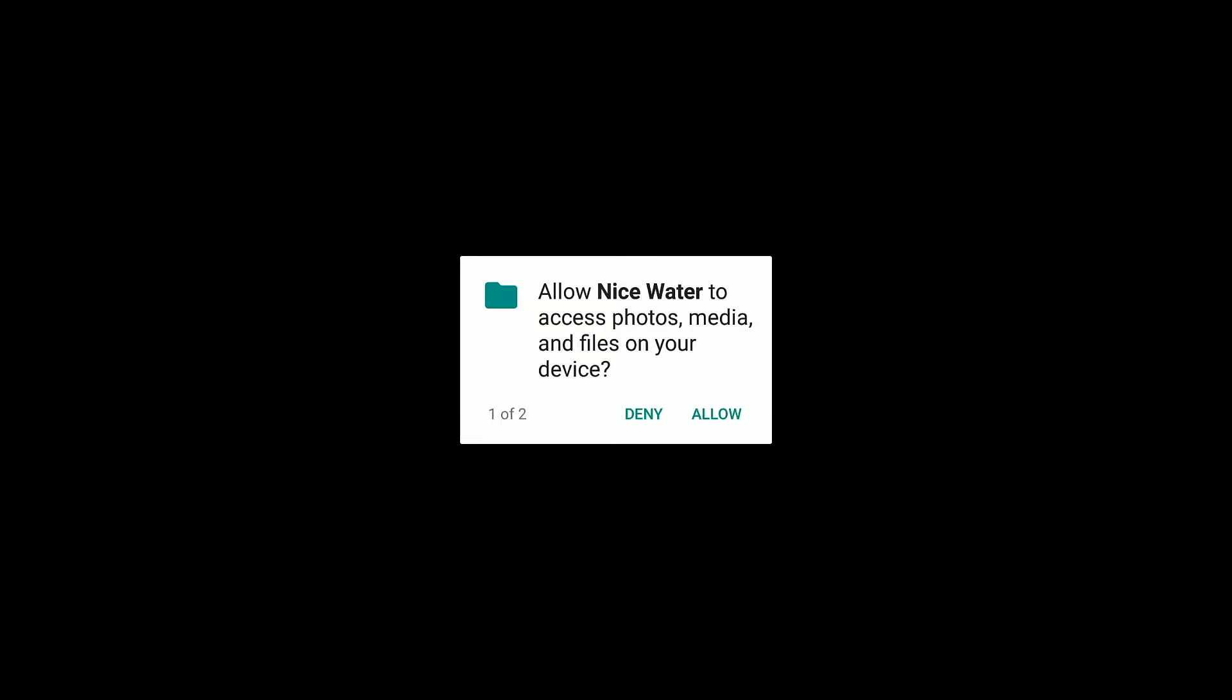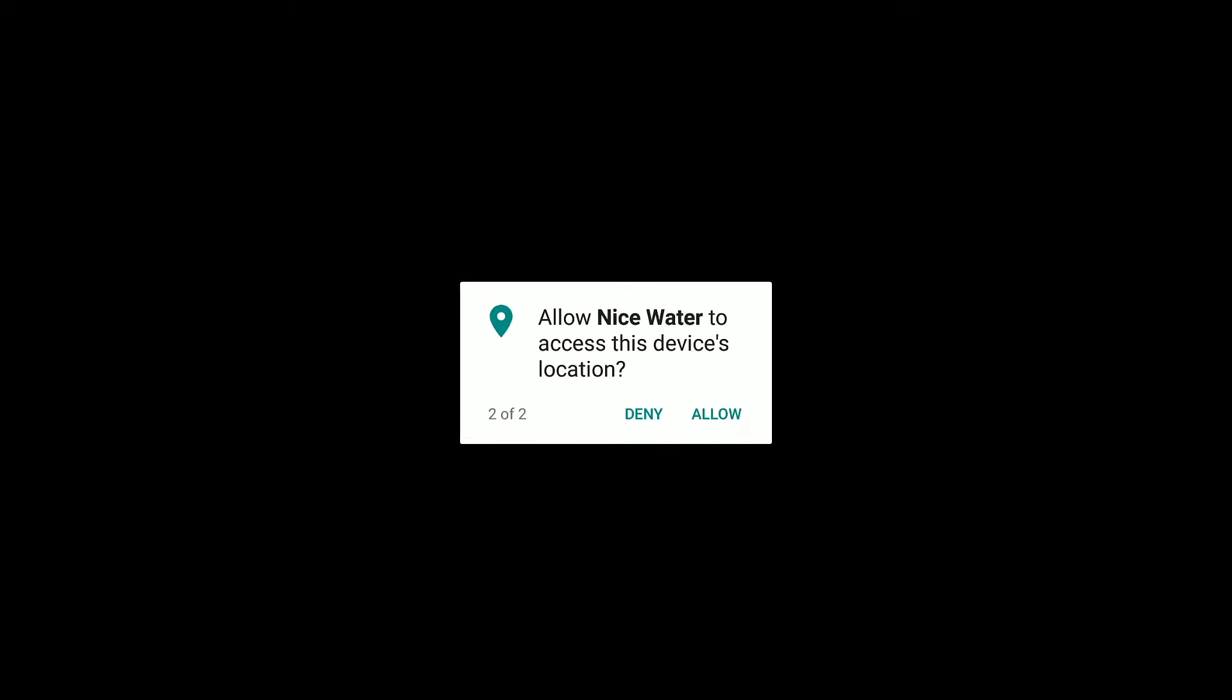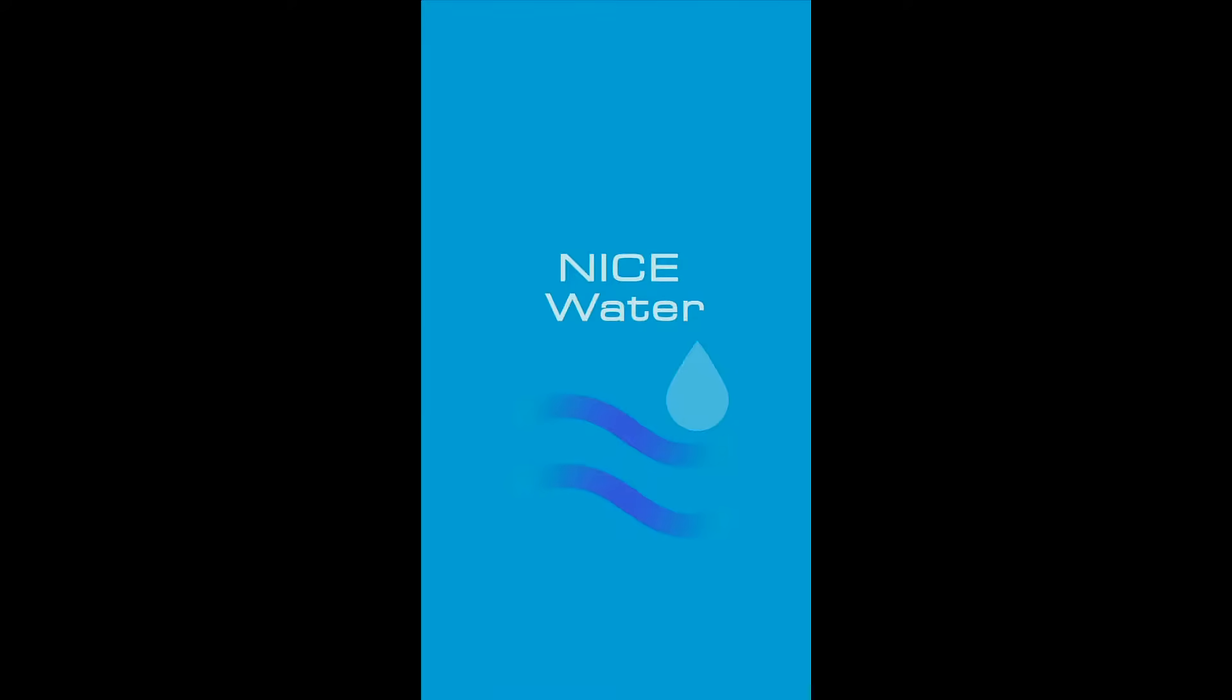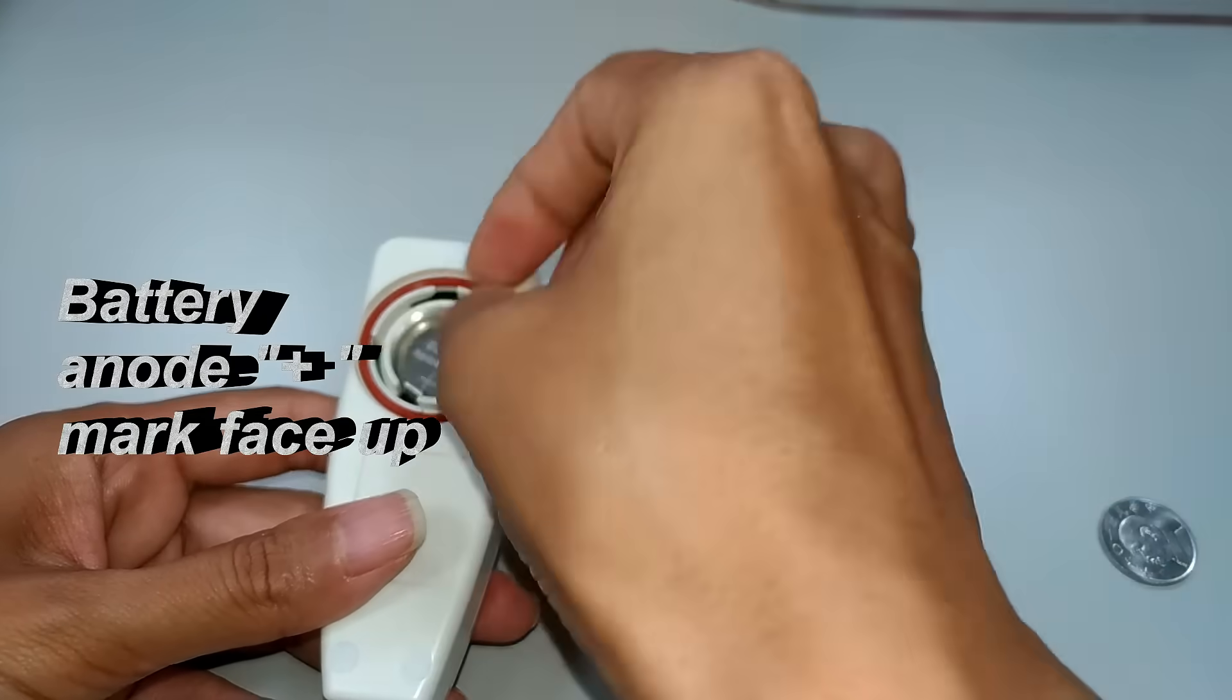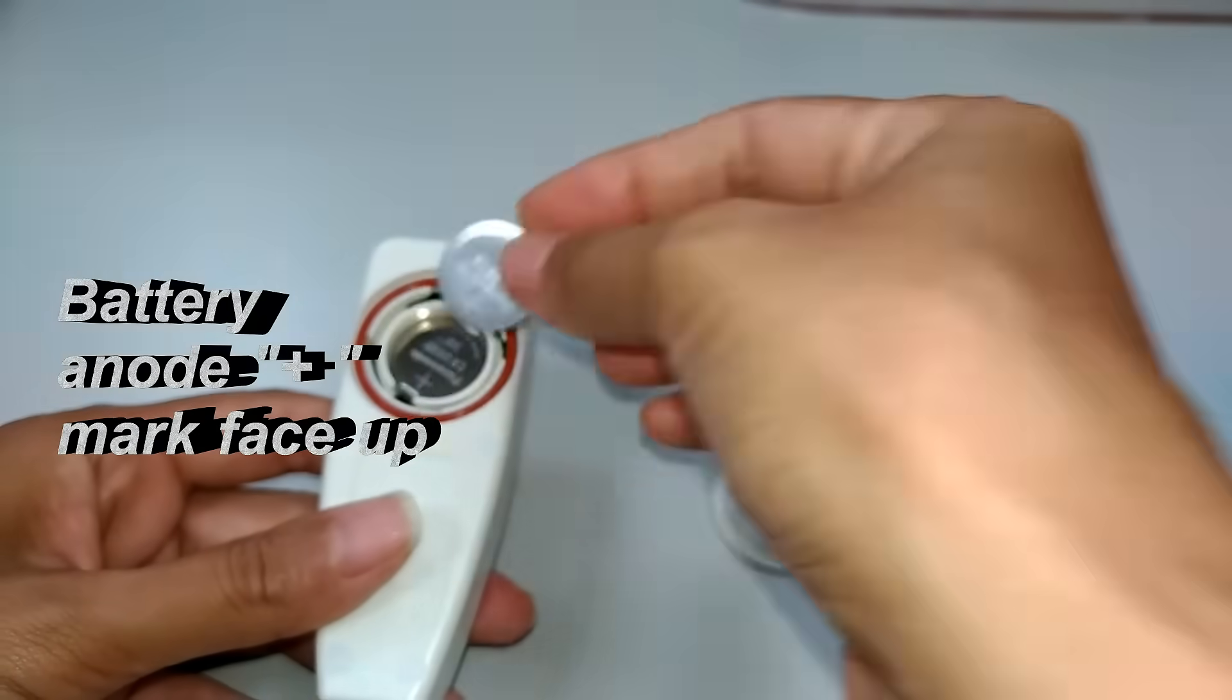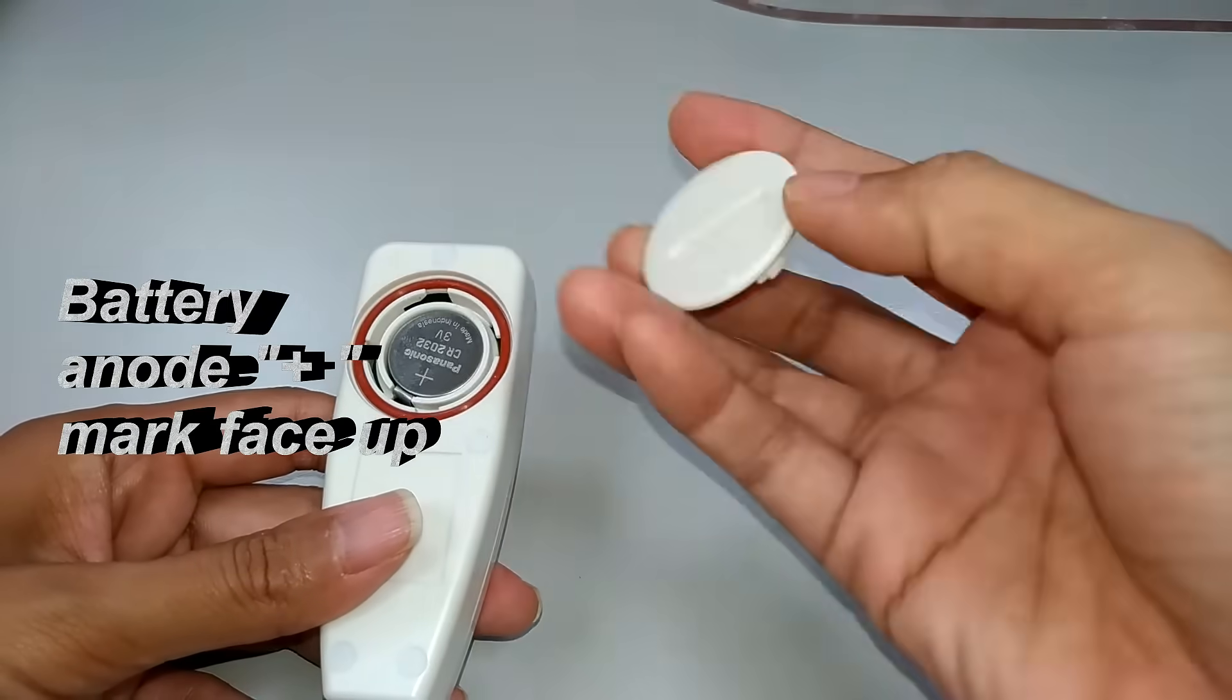Allow it to access your location and file store function. Now, let's make the PH Pen ready to use. Inserting 2 batteries in correct polarity.